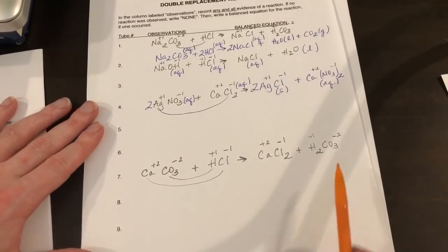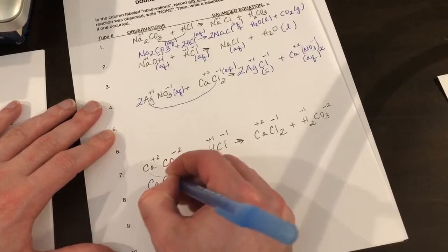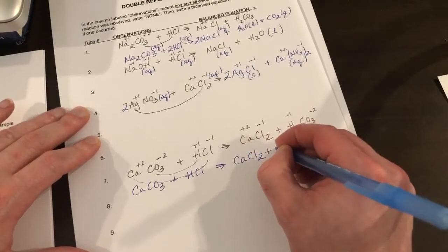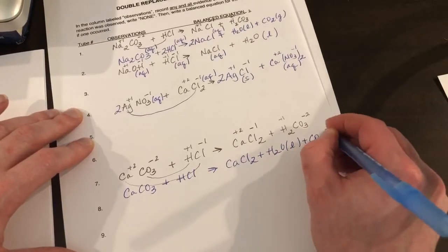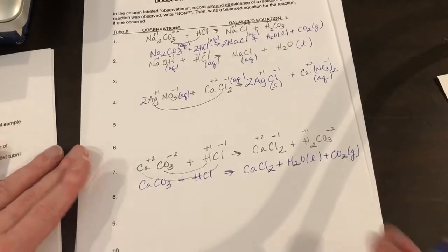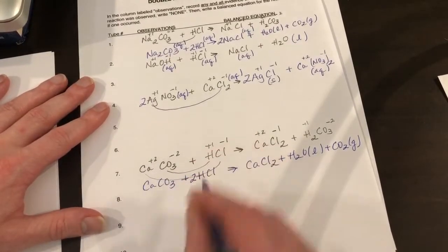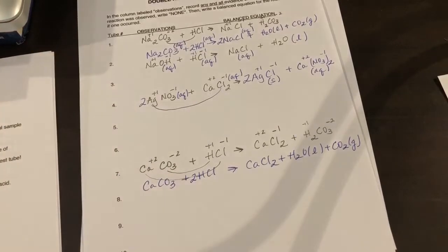Now, when you get this carbonic acid going on, it's always going to break down to water and carbon dioxide. Okay, so you're going to see some sort of bubbles going on. Now we're going to balance this thing. You got 2 Cls on this side. We need 2 Cls on this side. 2 H's, 2 H's, 1 CO3, 1 CO3. Should be balanced from there.